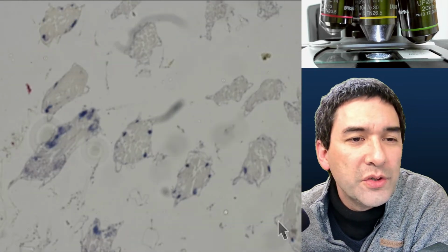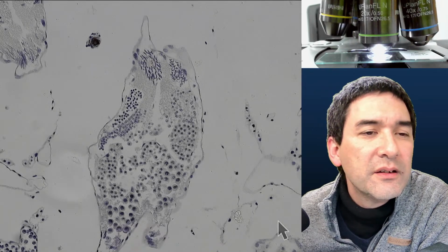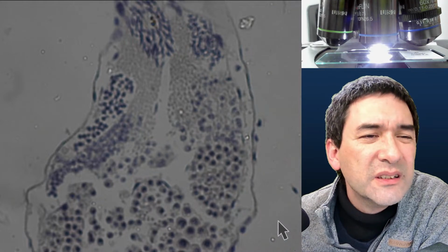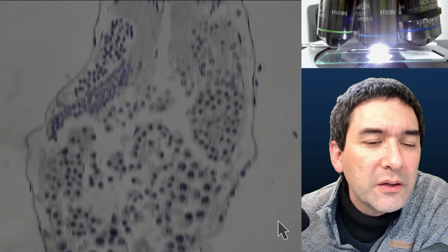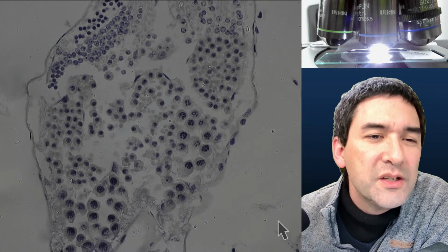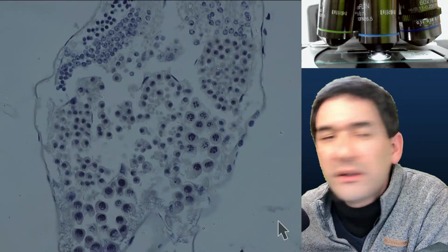I think not so interesting now. It's a histological section. I don't know if we're able to see the gametes here. I know too little about this insect. What are we able to see here? How did they stain that? Could this be chromosomes? If this, then this would be again interesting. I don't know. No, let's switch up.